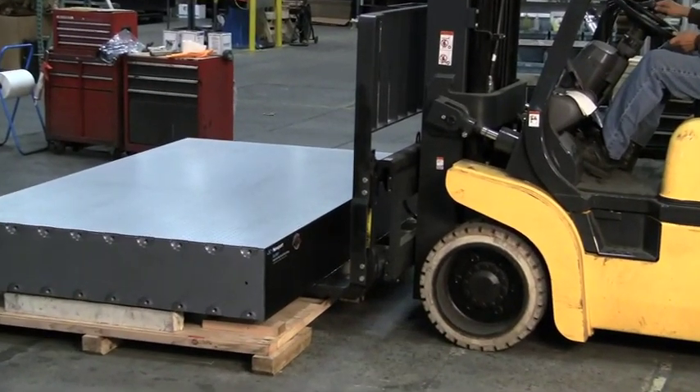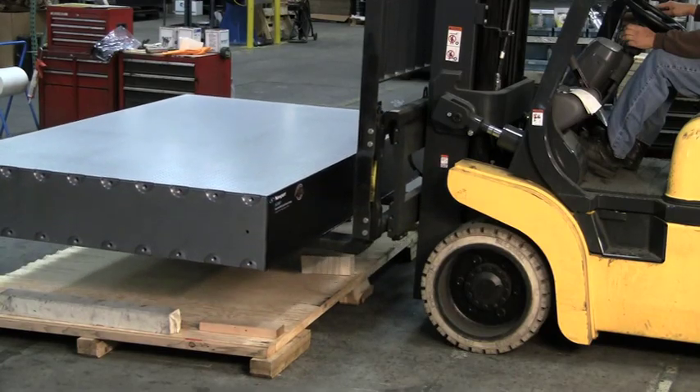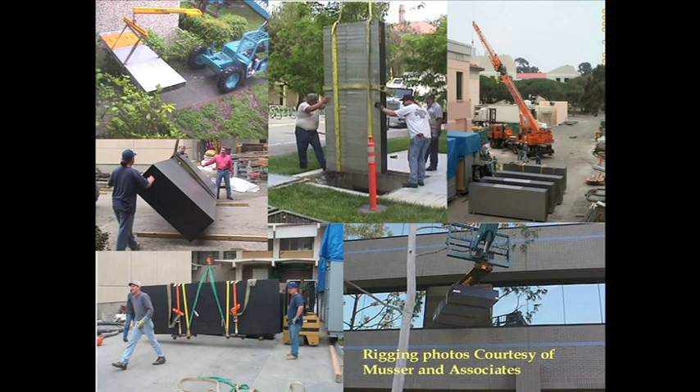If the final installation location is not accessible using standard lifting equipment, you may need to consult with a qualified equipment mover. Only qualified and equipped technicians should attempt to flip tables upright, and in those situations tables should be uniformly supported along the edges of their top and bottom steel skin.